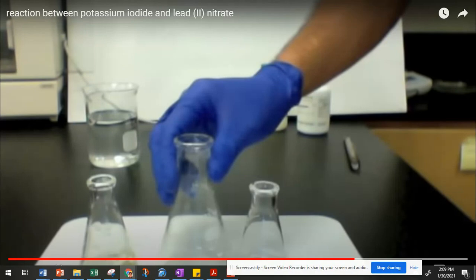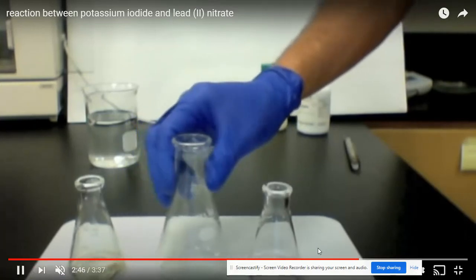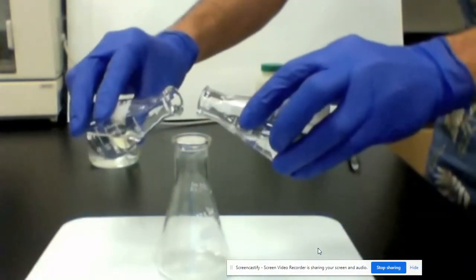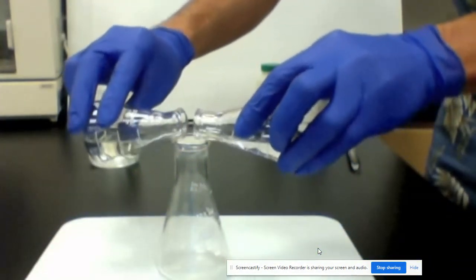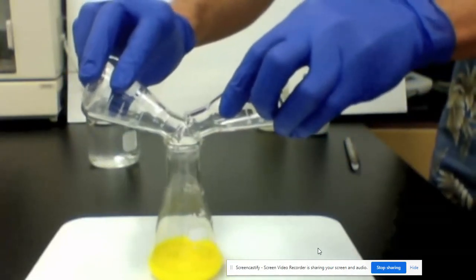The middle Erlenmeyer flask is empty right now, and what the scientists are going to do is add the solutions of potassium iodide and lead 2 nitrate to that middle flask, and you're going to see the very rapid formation of lead 2 iodide. So watch this. Okay, and that is our lead 2 iodide.